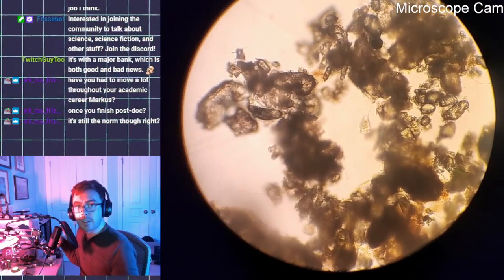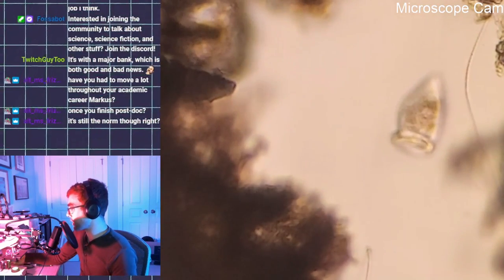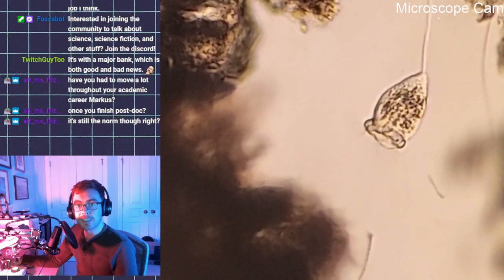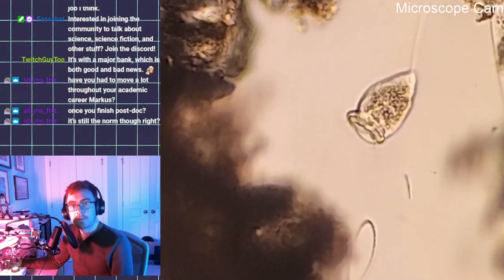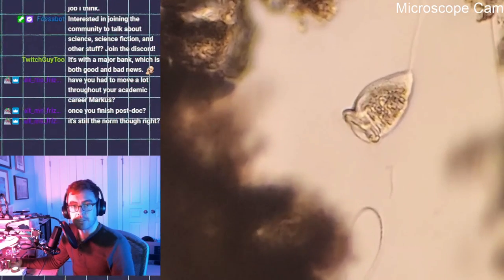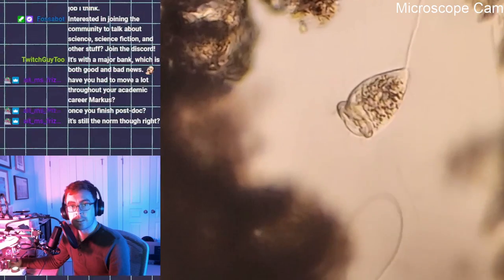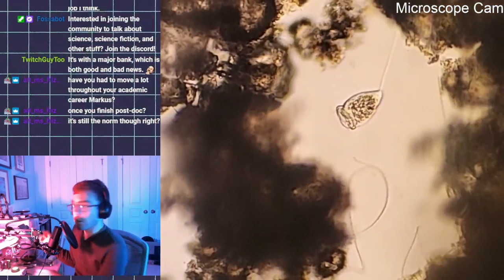Okay, I don't know what's moving, but I want to investigate. I believe that's just another vorticella. Yeah. Well, that's a good one, though. That's a nice plane. I appreciate when we can just see something very nice and clearly. What is this string thing, though? Yeah, whatever. Okay.